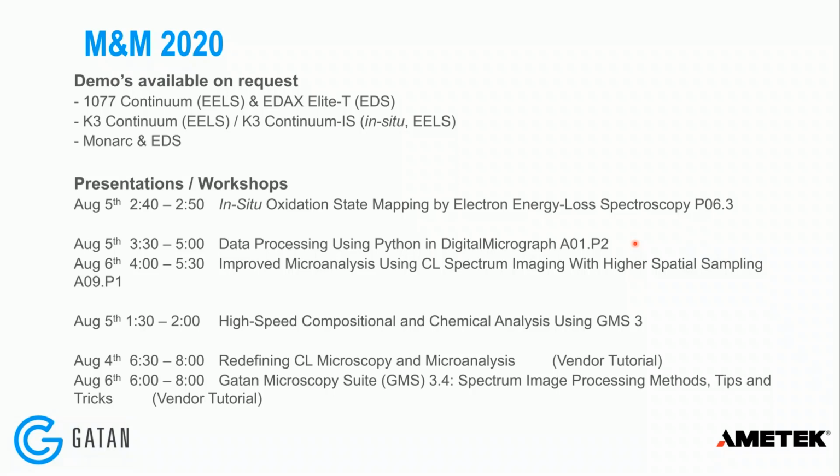Yeah, I think maybe you could say in terms of absolute hours, but I don't believe we've actually had to exchange one. The sensor is a field exchangeable part, so it can be changed out, but I don't believe we've ever had to change one due to radiation damage.